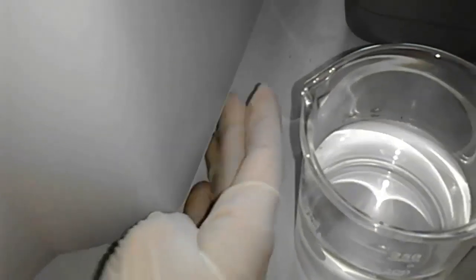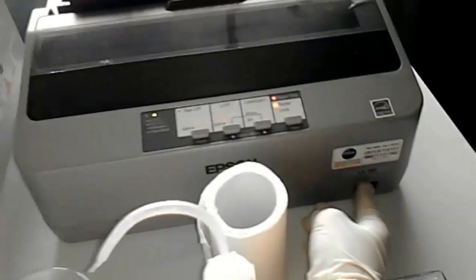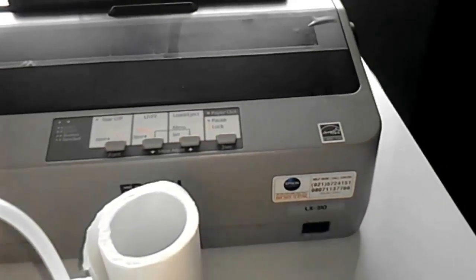Then turn off by clicking the switch on the right side. And turn off the printer. And don't forget to put silica gel into the spectrophotometer.